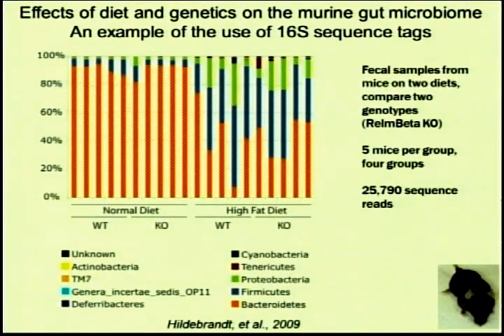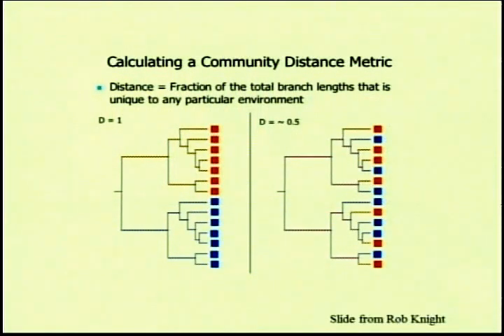So a tool that we and lots of other people like to use is Rob Knight's program called UniFrac. So I'm going to explain how that works and show how it operated over this data set, because this is a tool that we use pretty commonly and will likely come up in analysis over many samples and projects that people bring to us in the Microbiome Center.